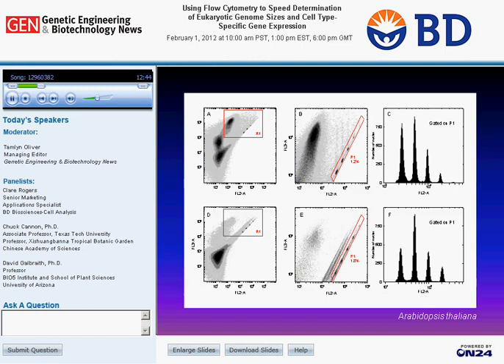And so if you go to the next slide, for Arabidopsis thaliana. Again, in panel A, you see the distribution of red versus orange fluorescence. You see in region R1, which is expanded in panel B to full scale, again, you can find a region, P1, of correlated fluorescence representing the DNA content. I should mention that the fluorescence that we're measuring here comes from propidium iodide ribonuclease staining, and the reason that we have correlated fluorescence is because we're spilling over the propidium iodide fluorescence into the FL2 and FL3 channels. But being correlated, you could put a window around it, P1 window, and then gating on that you get in panel C a logarithmic distribution showing very nicely the 2C, 4C, 8C, and 16C, and possibly even 32C peaks.